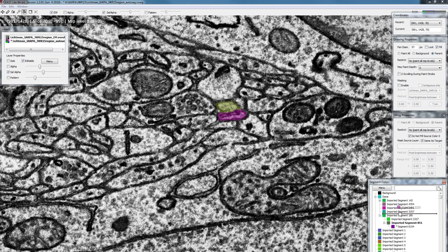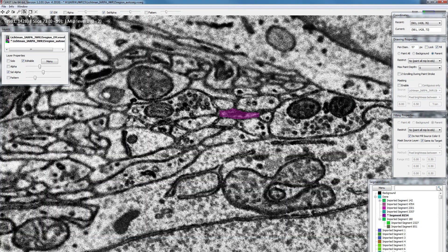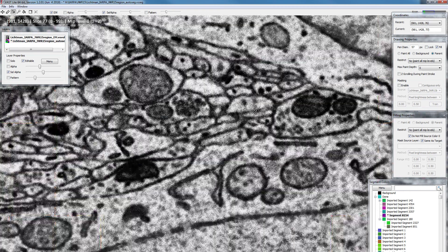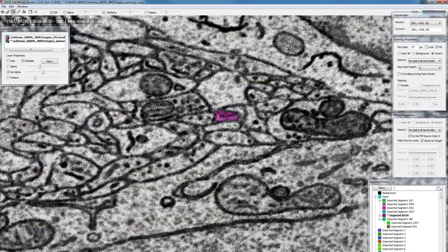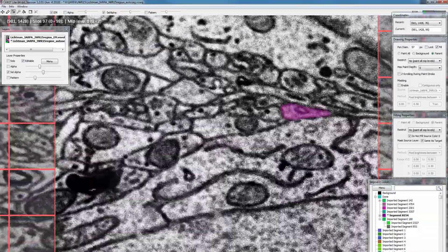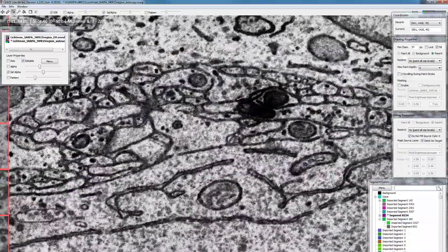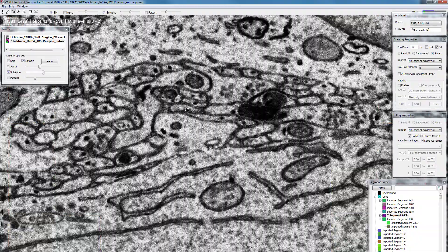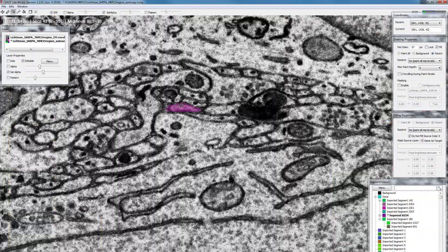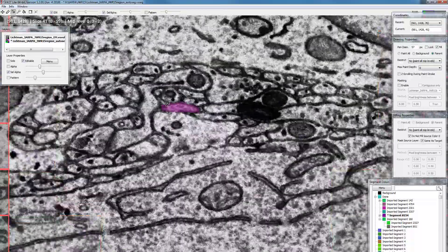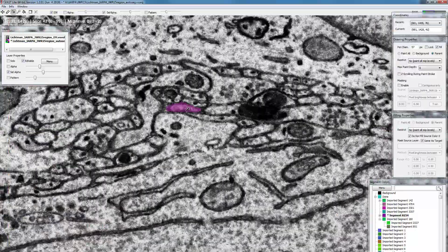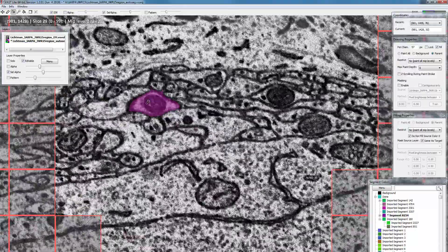I can take this object I just made and put it as a separate object in my done folder, and I'll continue briefly by finishing up this original object — collecting the part that continues in a different color. As you can see it now has a child which is the collected color. Going to the other side, you can see that this jumps here — I think this is one of the reasons we have these splits; the alignment is not perfect. This object is now continuing here.